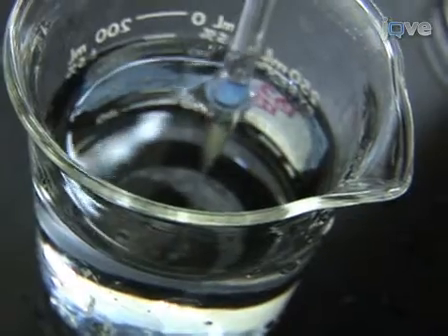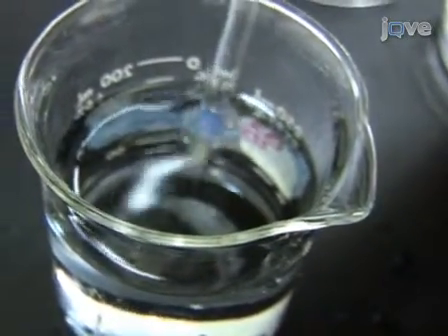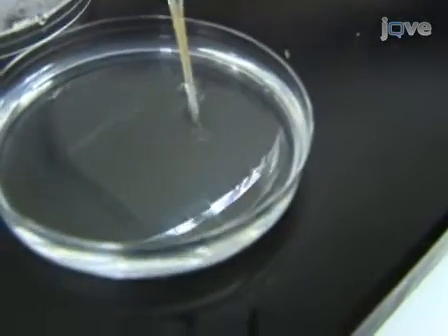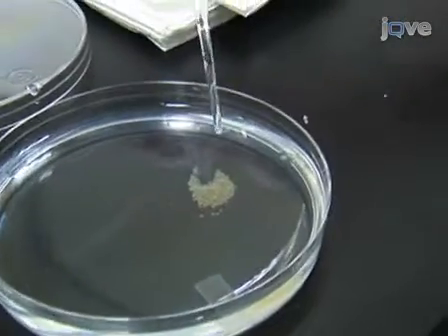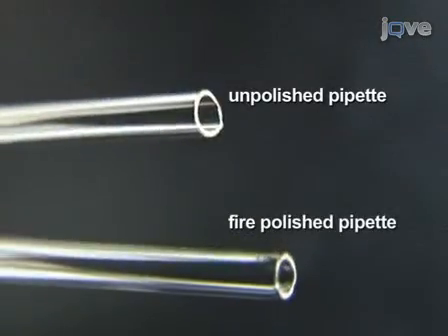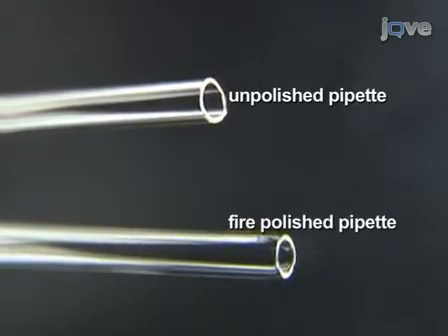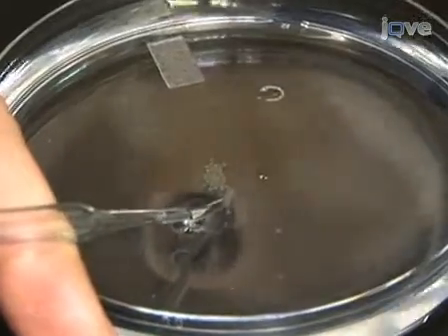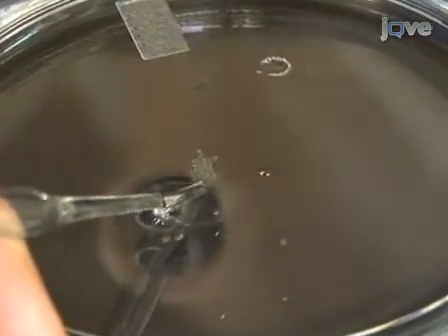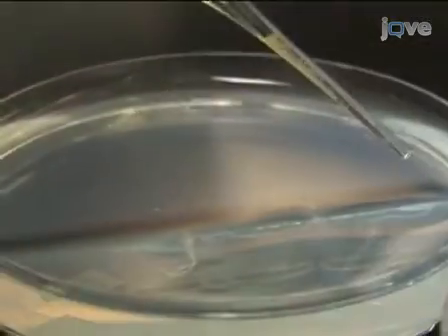If anything still is in its chorion, then the act of pipetting them like this will get them out. And then release the embryos so that they never hit the surface of the water. It is important to handle dechorionated embryos with a pipette that has been fire polished to smooth its edges. Gently transfer the fragile, dechorionated embryos into the trough of the injection dish using a wide-bore, fire-polished glass pipette.